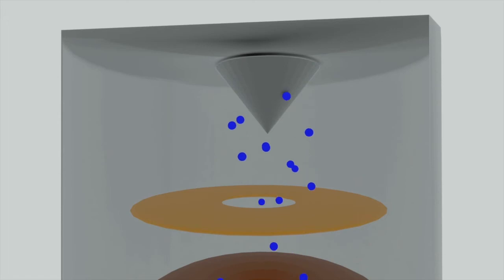Before using the SCM, the electron column must be in a vacuum system. This will then allow the electrons to travel while not being interrupted when approaching the sample. Once the column is in the vacuum system, we can now use the electron gun to shoot out the electrons through the column.